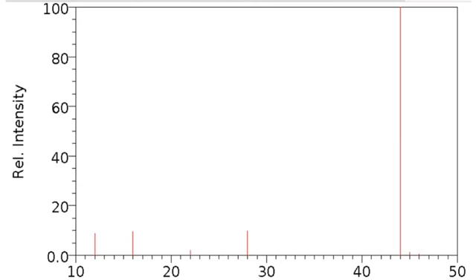Okay, so you look at the heaviest one to find the whole molecule. The whole molecule has a mass of 44. By the way, I think in the last slide I might have said the mass wrong for that heaviest peak, but I labeled it.